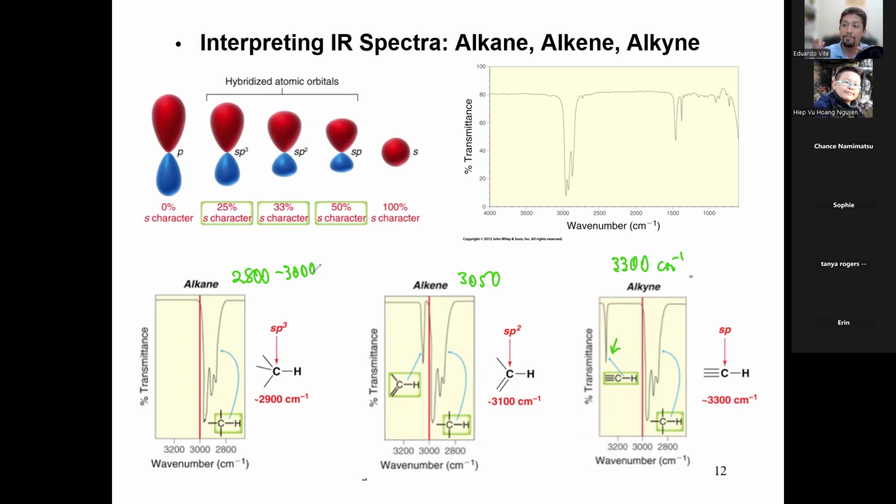And it makes sense because triple bonds are stronger, so their wave number is bigger. And so you see it has a weak, sharp peak if it is a triple bond and if it is a double bond. Weak, sharp peak. But the sp3 CHs have a shape like a picture of a cave, with the stalagmites. That's what I like to call them.